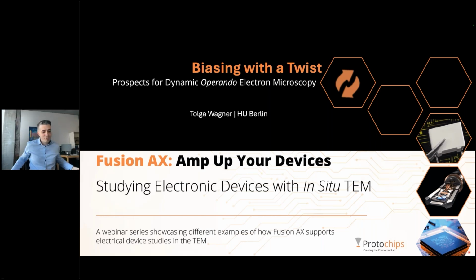And of course, thank you for giving me the opportunity to speak here at your webinar series. I will use this opportunity actually to give something back to the community. This is the idea from my side, because I tried so many attempts to put biases on tiny TEM specimens and failed so hard so many times. My goal is to give someone who wants to start doing biasing a bit of a head start due to my mistakes, which I will show you today.